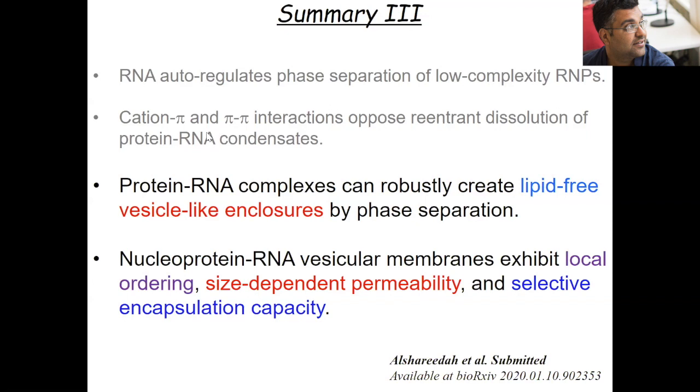Thanks. There's a question from Hilong again, who's asking, is the vacuole-like structure likely to form for very small diameters, like tens or hundreds of nanometers? Yes, so we have seen, like I said, quite a bit of heterogeneity or polydispersity, and we have seen even sub-micron condensates could have hollow structures. Yes, but again, we cannot go beyond 250 or 300 nanometers using normal confocal microscopy because of the resolution issues.